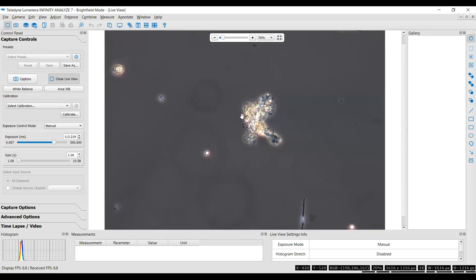And then see this little colony here? Even though it's under something, which is a problem, it looks to me like those cells are peripheral. I believe that's cyanonephron. Is that what you would call it, Andy, when they're peripheral like that? I can't tell from that. It's hard, since I was at 1000X. So again, you could just put that into a colonial cyanobacteria with ovoid cells.